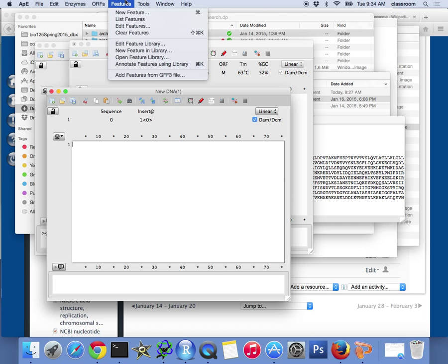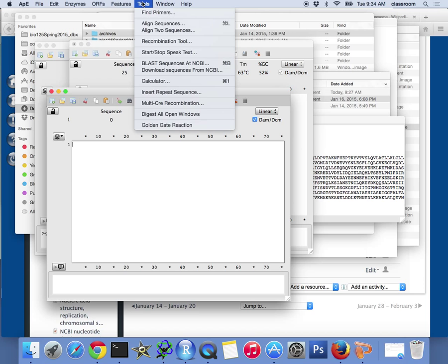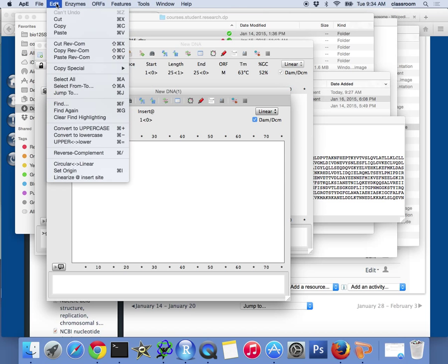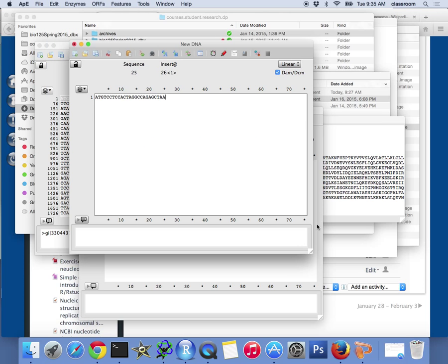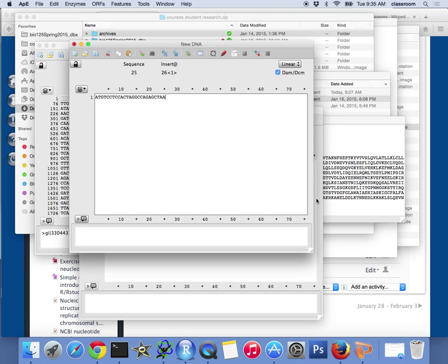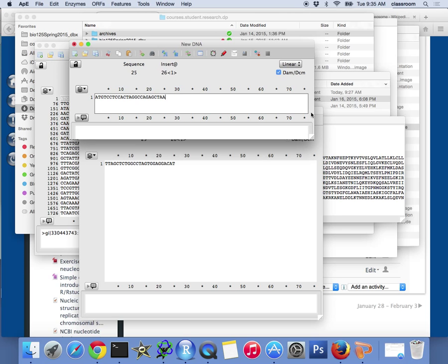Instead of just pasting, I'm going to find out the reverse complement strand. I'll go to Edit, Paste, Reverse Complement.